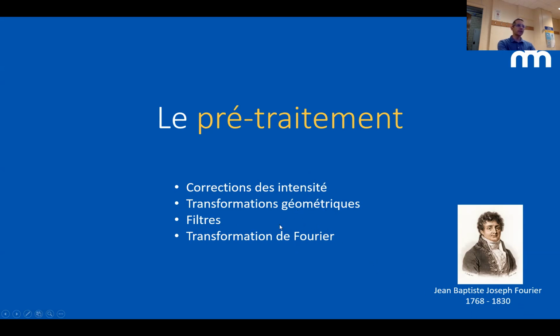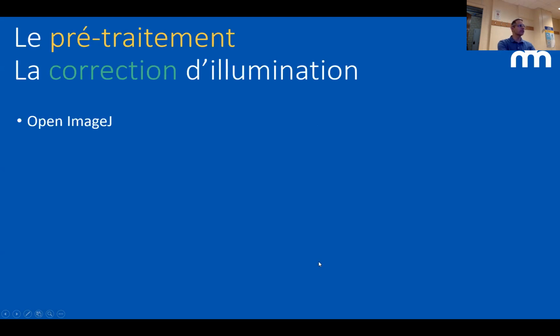It's a very interesting way to look at images, and I just want to give you a sneak peek of what it is. Maybe some people will say, oh, I've never seen this before.